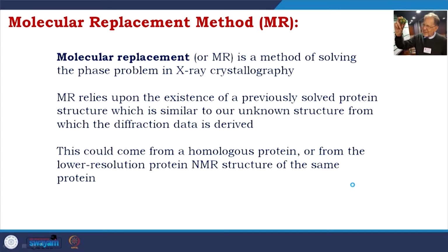Actually, I would say molecular replacement is a method which made a revolution in the field of crystallography. Why? Two reasons. When I am talking about using metals, it sounds cool, right?